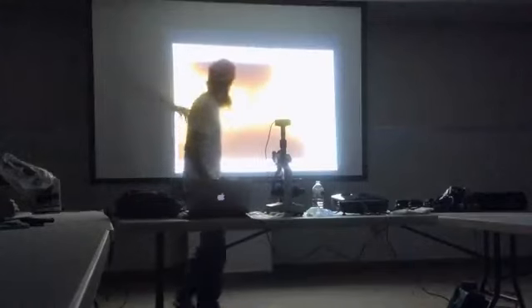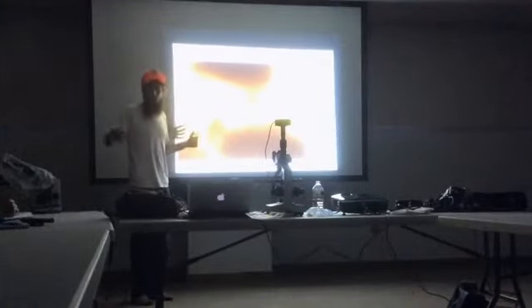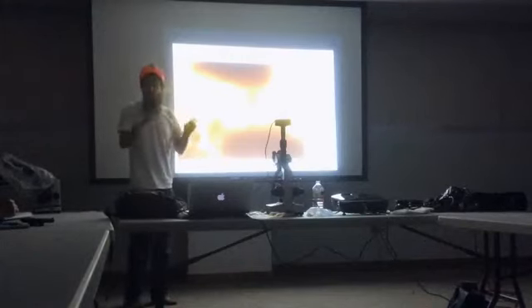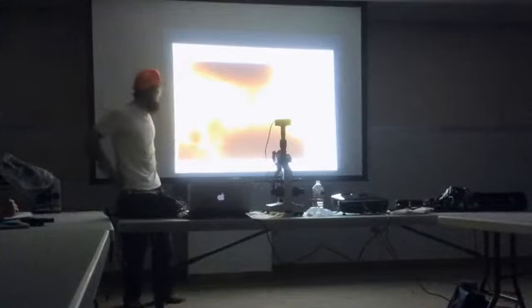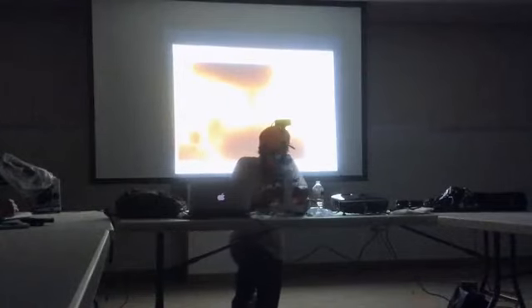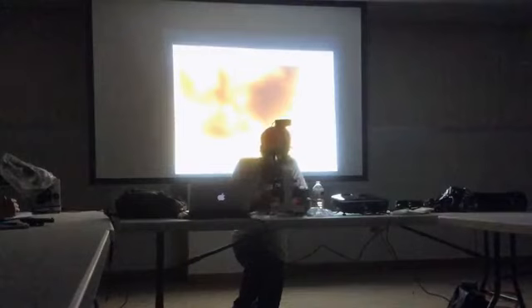And in this view, I found another fungus. So I know that I'm getting closer to that equal ratio, because everywhere I go, I should find at least one. This thing's moving. See, moving.